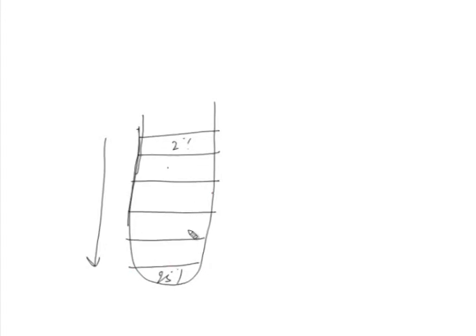the next one, and the lightest one at the top, or it could be by a gradient maker, as we have discussed in earlier sections. You can use a gradient maker to make a continuous gradient, where the lowest part at the bottom of the tube contains the highest gradient material, and the upper part or the start of the tube has a lighter or lower concentration. The sample, of a particular material or components, which could be macromolecules or subcellular organelles, will be placed here, and then centrifugation is performed.